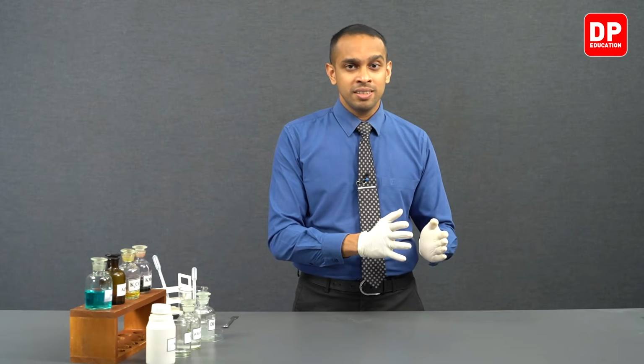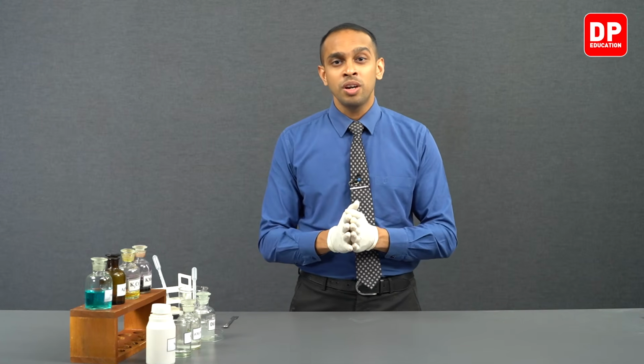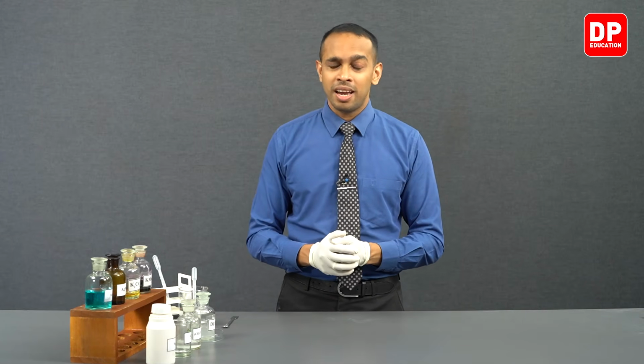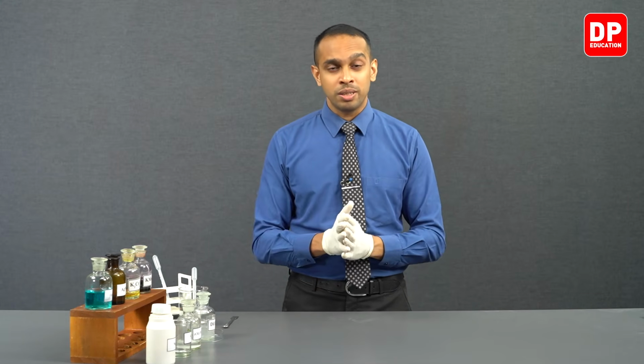When you send hydrogen sulfide gas through another oxidizing agent such as acidified dichromate ions, we saw the orange color of the dichromate ions first change to a green color, and afterwards we observe that the solution is starting to turn a bit unclear or cloudy.